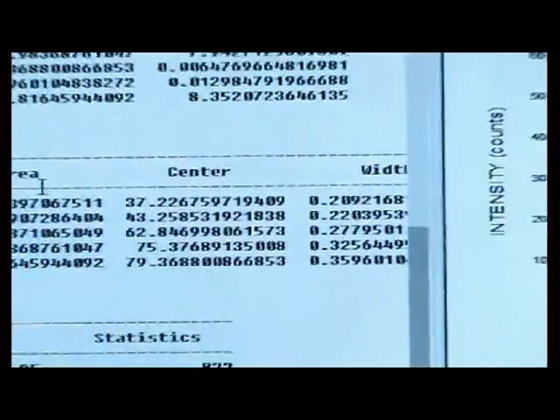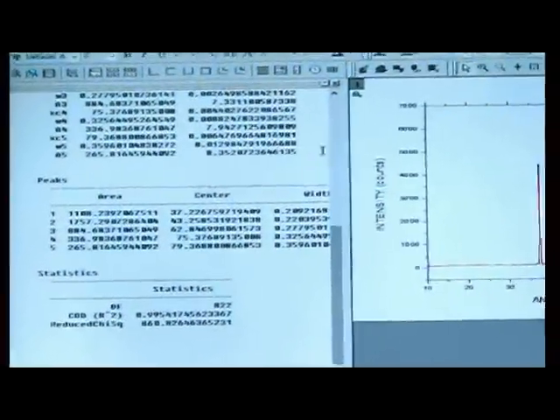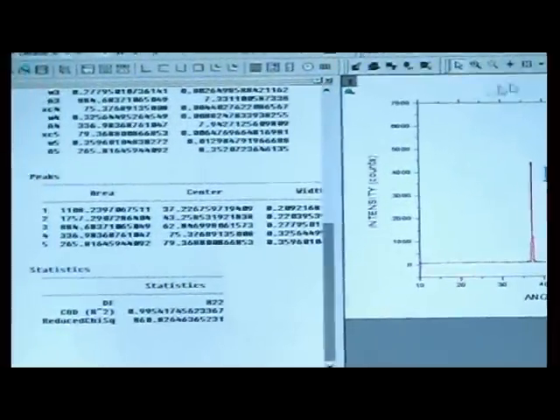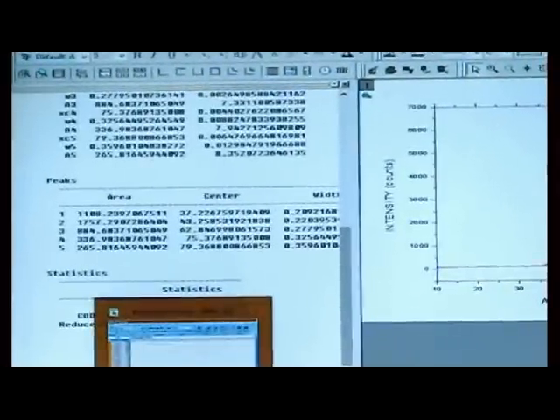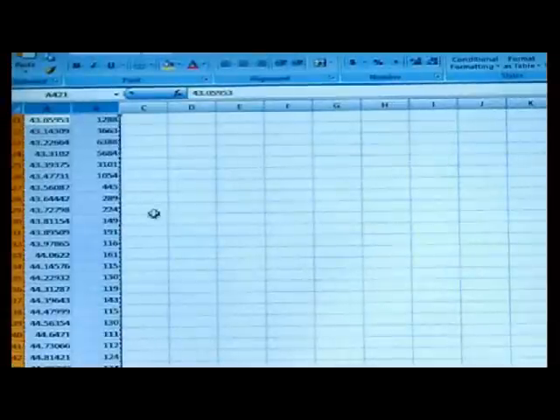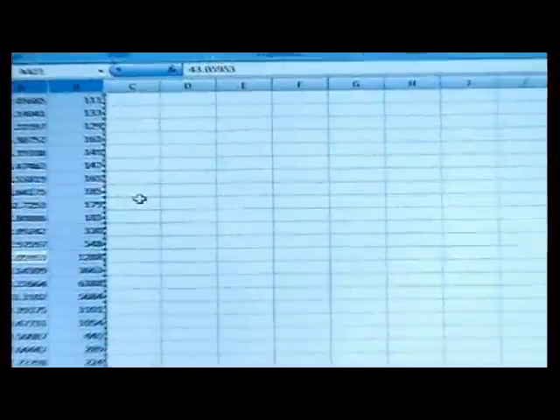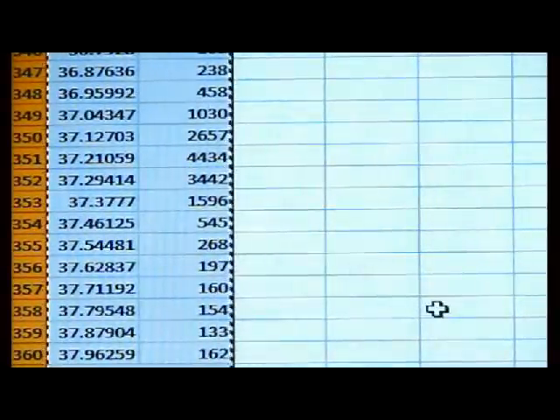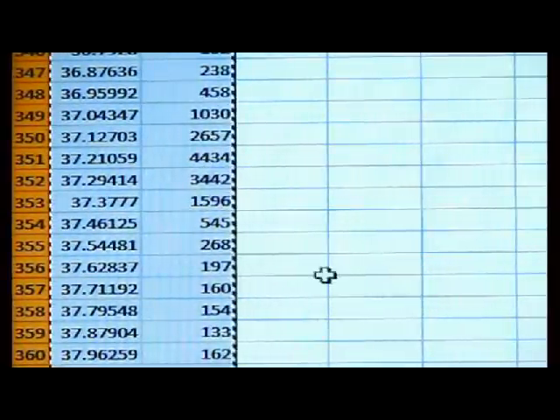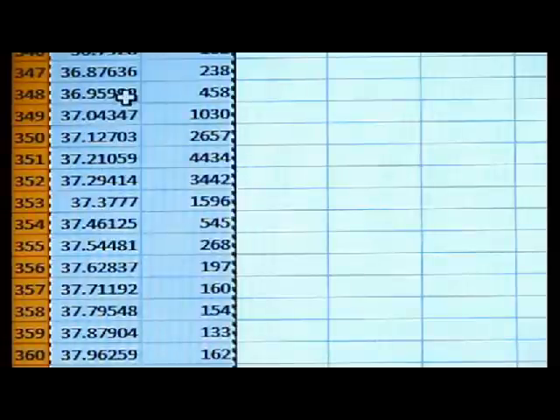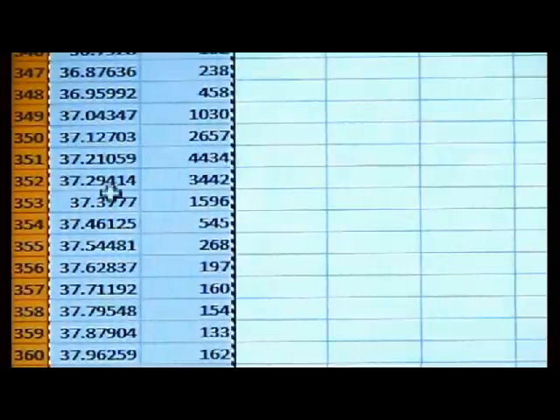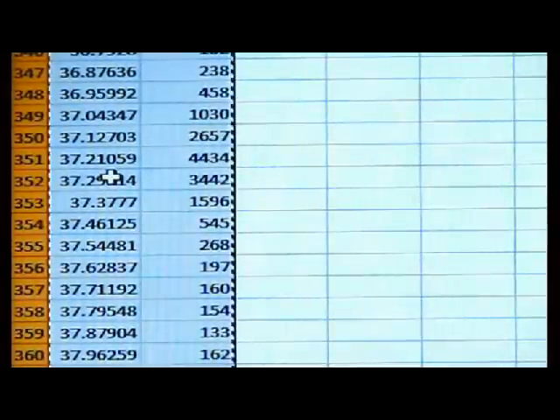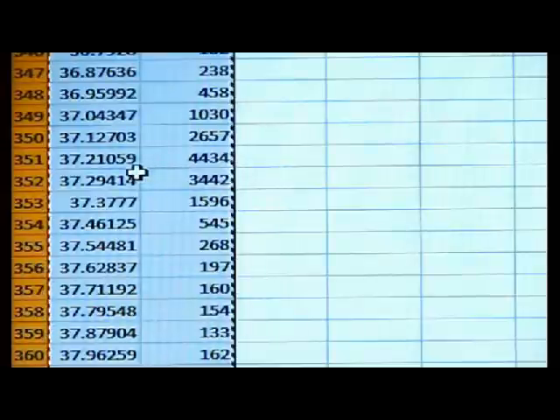Note the peaks and compare it to the given XRD Excel file. We have to go to the Excel file. Here, note the peaks which match with the earlier data which has greater intensities. We get the first peak of 37.22. Compare it with all the given data. Now here, 37.2105 got the maximum intensity. So it is the first peak.